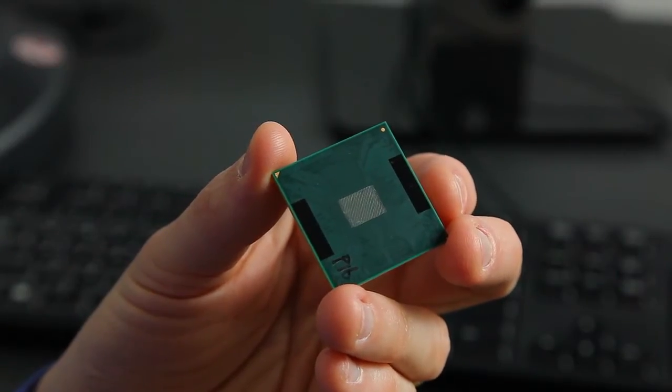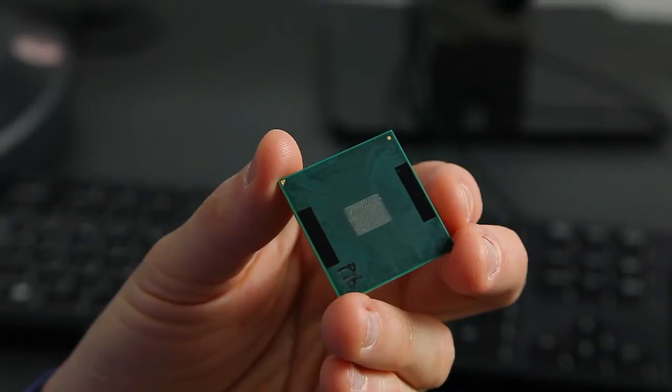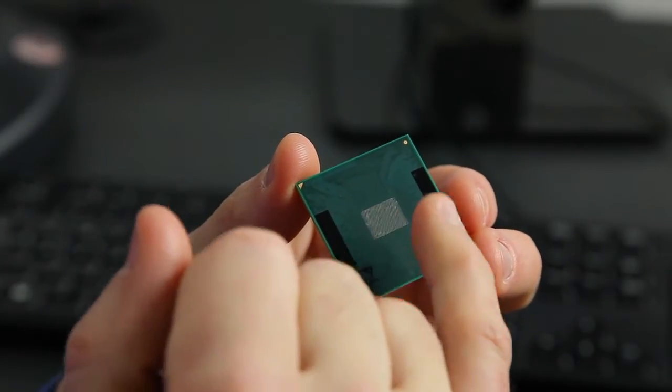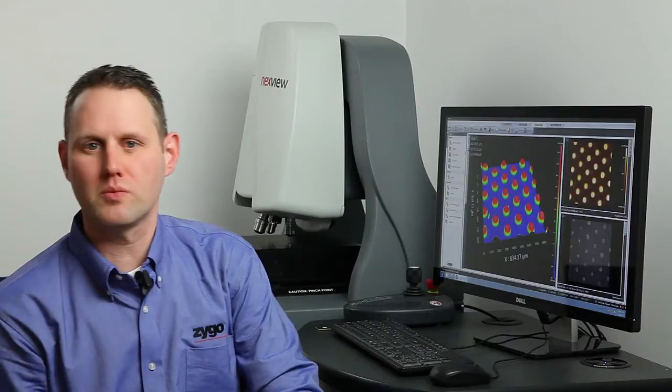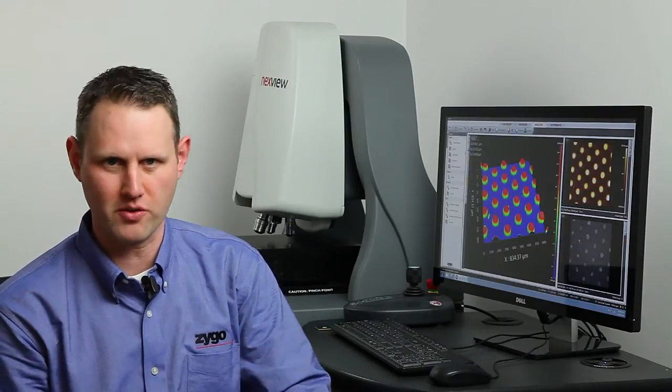So the sample we're going to be measuring is this semiconductor package showing solder bumps in this gray area in the middle. The reason an engineer might care about that is that these bumps are critical for making electrical contact between multiple surfaces, a substrate and a chip for example.